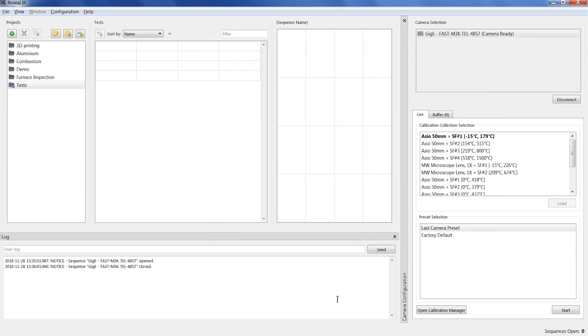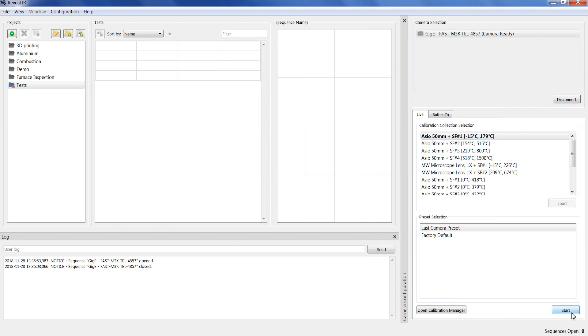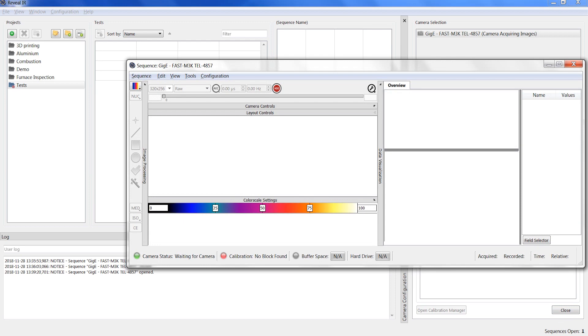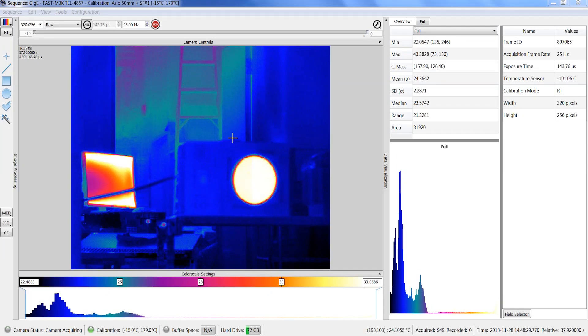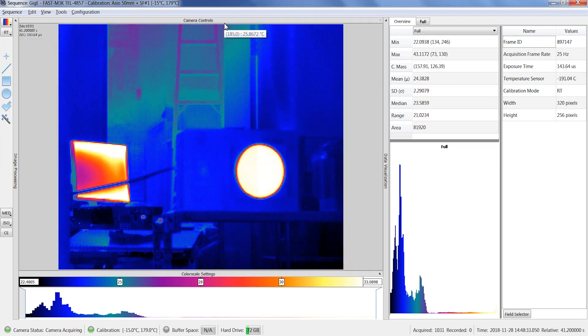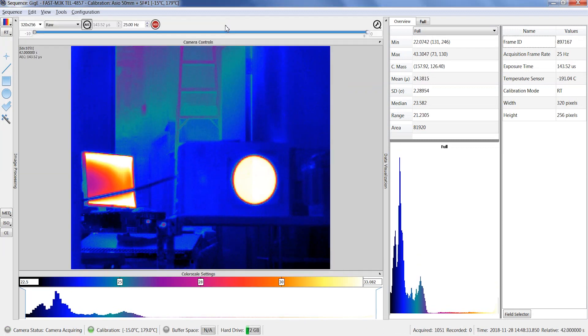In the live tab of the main menu, you can select the calibration to apply prior to starting the acquisition. The sequence window will then appear. This window is slightly different from playback mode. You are now ready to change the different parameters for your acquisition.